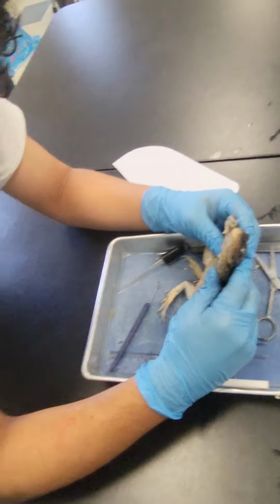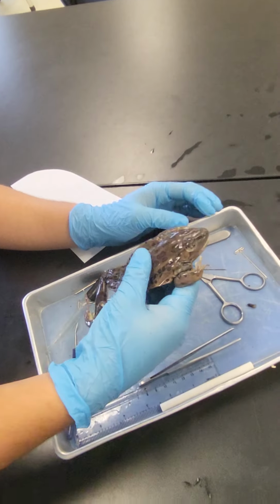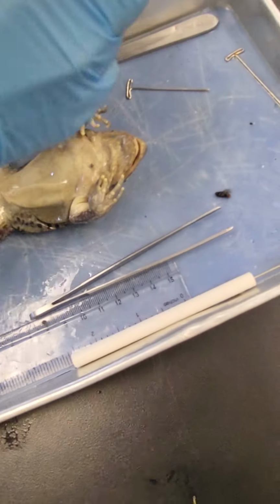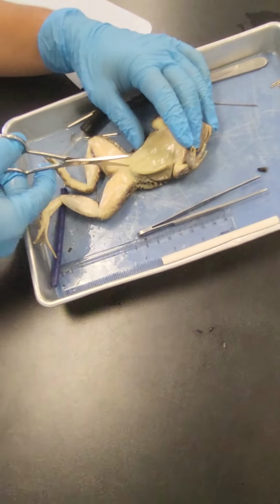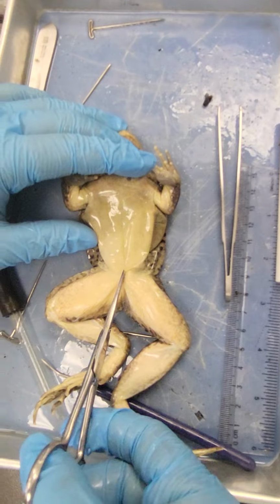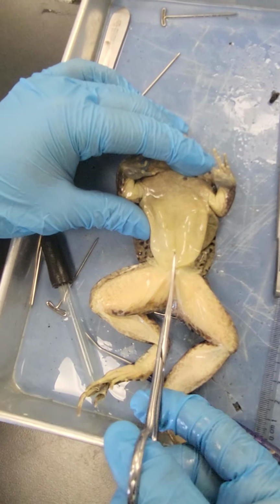Place the frog in the dissecting pan, ventral side up. Use the scissors to lift the abdominal muscles away from the body. Wait, first we gotta cut the skin, right? Yeah, cut along the midline of the body. Evan, you forgot to say cut the skin. That's what I'm saying right now. You said cut the abdominal muscles. Do what she did in the instructions. No, don't go that deep. Cut along the midline of the body.